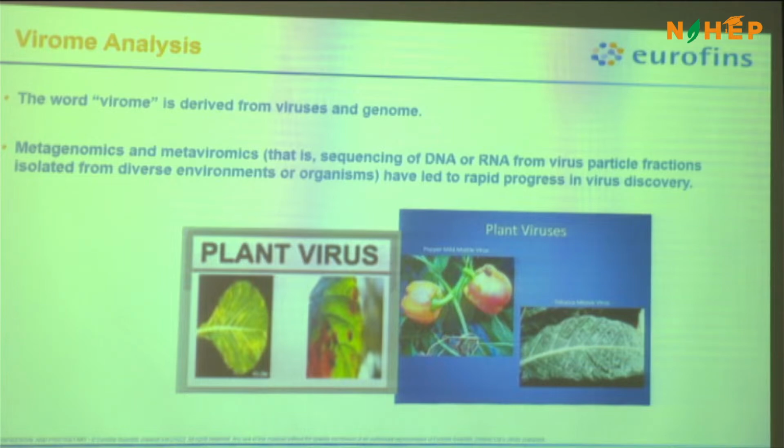But if your objective is just to target the RNA-based viruses and you only want to know which RNA-based viruses are present, then if you do total nucleic acid, you're wasting your sequence data, right? So instead we'll just go with the RNA-based viruses. We'll extract the RNA, sequence it, and then identify the various viruses which are present.